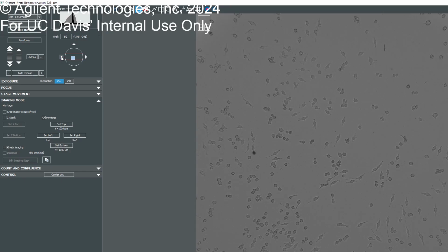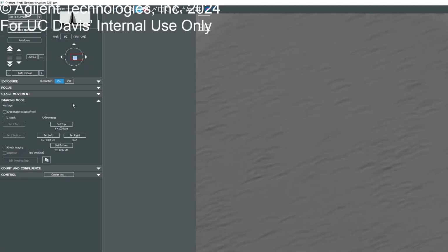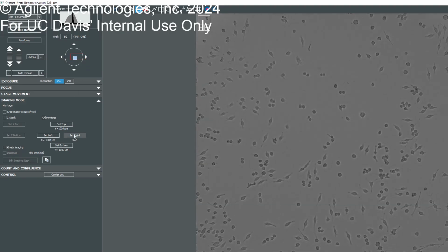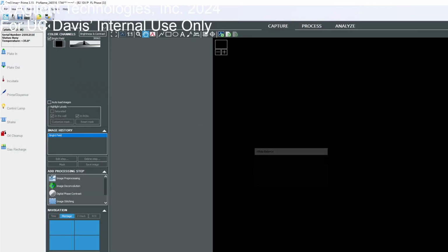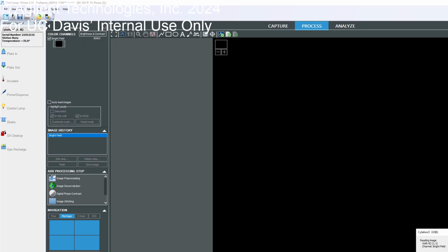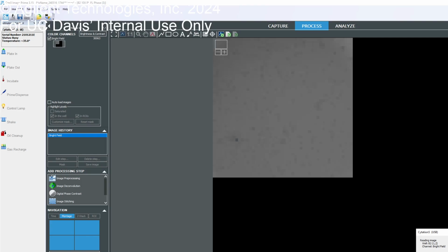I don't know if it was because we were still on the old software, but we tried to do a montage once and it was stitching in the wrong areas. So it was all chopped up. I've seen that happen once, and it was because another instance of Gen5 was open on that day. I noted that if something is open, then it just completely destroys your stitching algorithm for some reason. So we check that first, and if that still happens, just email me.